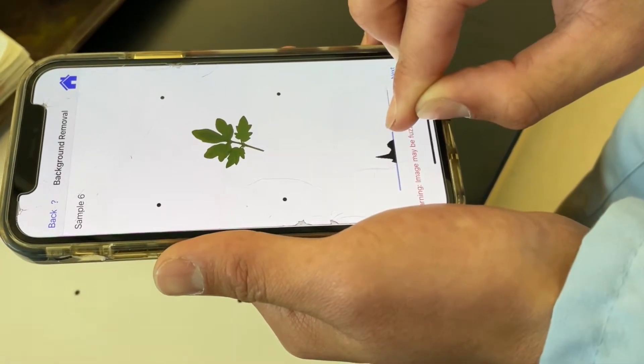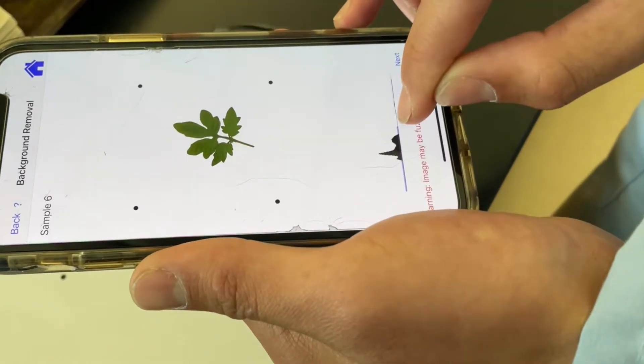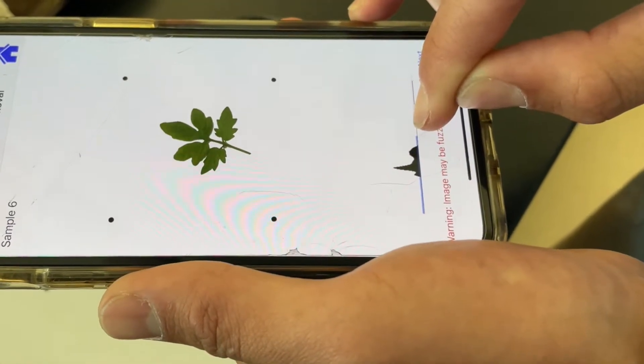So you kind of want to get it so that it's only the leaf. See how that area right in the middle lessens — that's what you want.